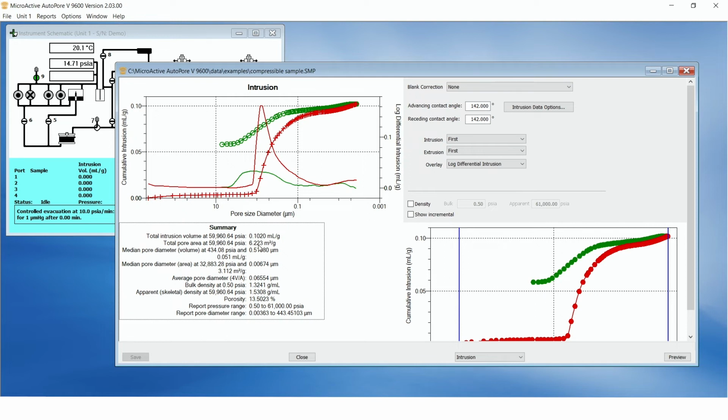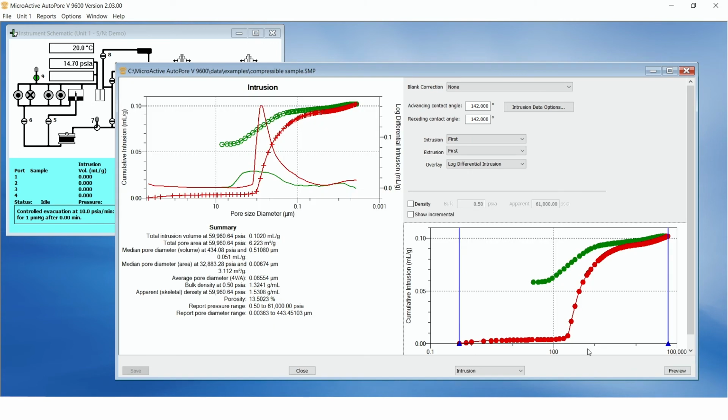We actually have a BET analysis of this that tells us that it has much lower surface area. So we suspect that this is compressibility up here. Now, we could simply edit these data out, but there is some compressibility taking place even in the part of the distribution that is pore filling. So rather than just simply truncating the data, let's remove the effects of compressibility.